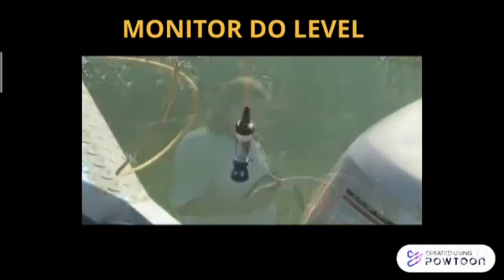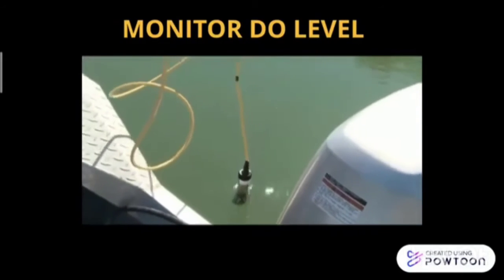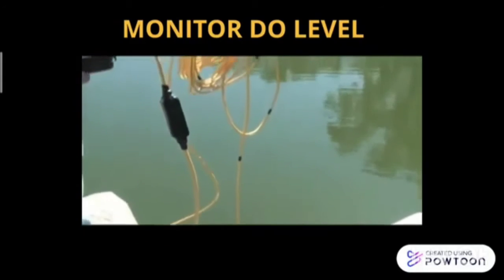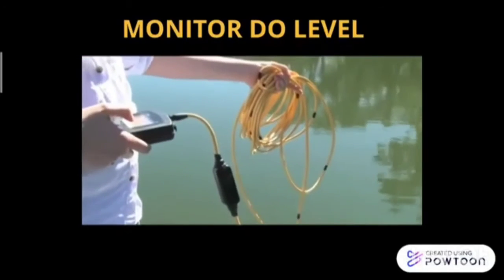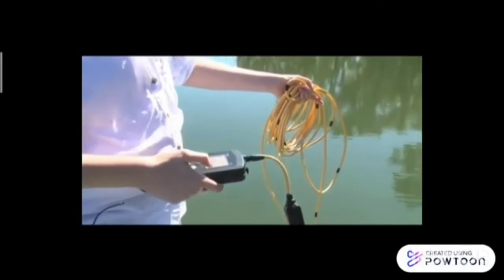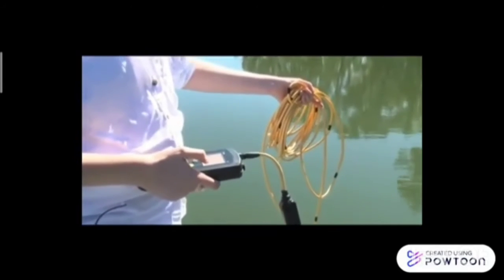Moving on to the dissolved oxygen level. To measure the dissolved oxygen level in ponds, we can use an oxygen meter. To use the oxygen meter in outdoor ponds, as explained in the video, the equipment depends on light. Thus, if the meter is placed in the water, the top of the pond has a higher oxygen level compared to the bottom due to stratification.